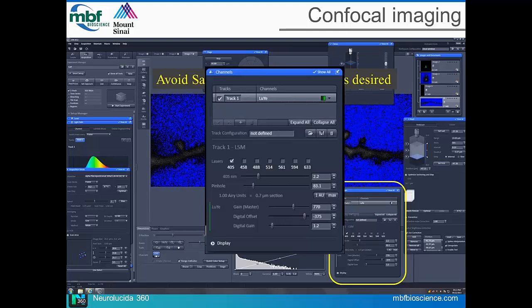And there's a reason why the confocal microscope is set to 1 Airy unit. If you open it larger, you're going to have too much signal coming in, too many photons coming in. And then you have to ask yourself, is that signal really there or not? And for this purpose, you don't need to have more than 1 Airy unit. It's different if you're doing a different immunohistochemistry sort of analyses. But for spines and for filled neurons, you really don't have to have more than 1 Airy unit.